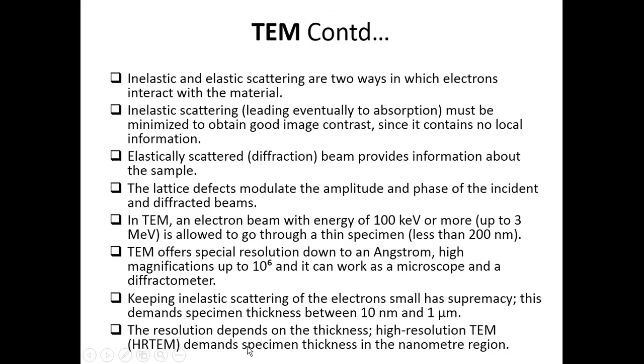Okay, the resolution depends on the thickness. High resolution TEM demands specimen thickness in the nanometric range. Of course, in order to have high resolution in the readings taken in the measurement or characterization of the material, the specimen thickness must be in the nanometric range.